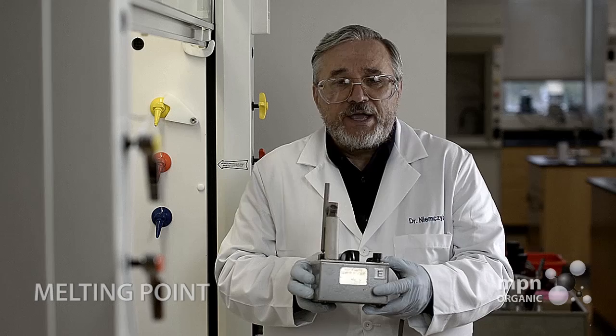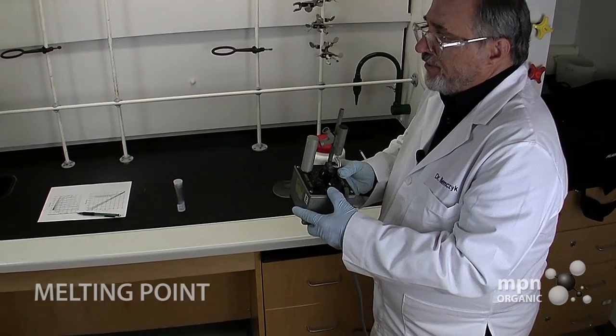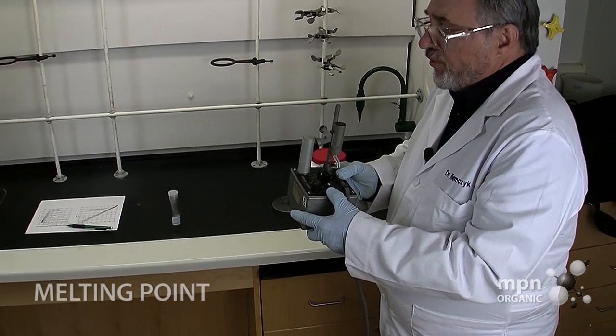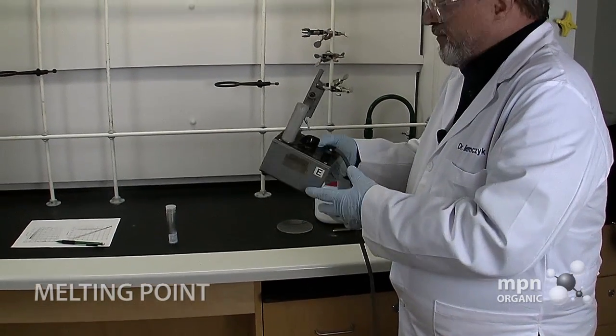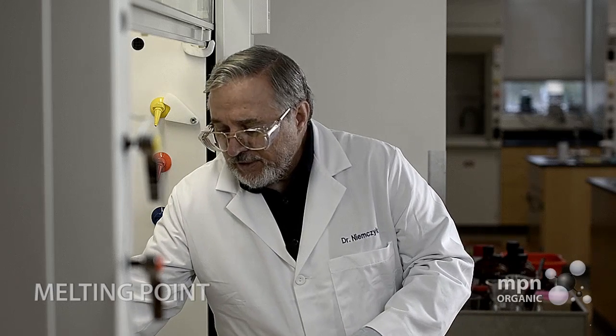Now we have two varieties of this Mel-Temp in the lab. This is the older of two varieties, but it performs the very same function. So we're going to be using that.